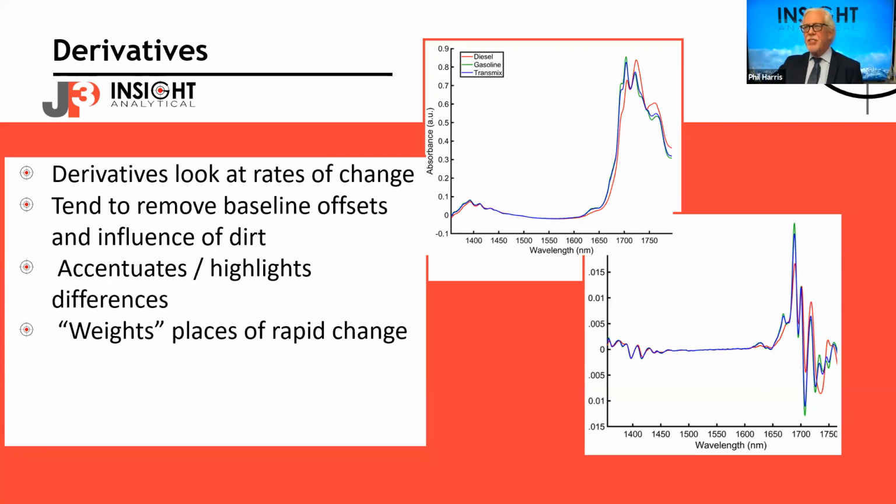The ASTM method says repeatability of 2.3 kPa, reproducibility of 4.2 kPa. So we're right in that same lab accuracy range. The tough part is when you're trying to do trace concentrations. But when you're doing bulk physical properties and bulk components, it's a lot easier with infrared spectroscopy. At low concentrations you don't get much absorbance, and that's where your errors will be higher typically.